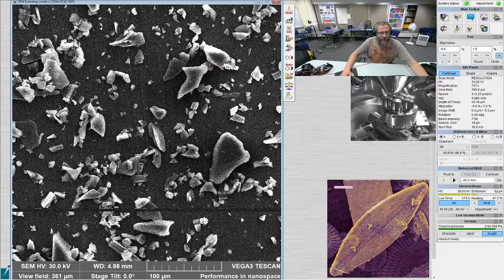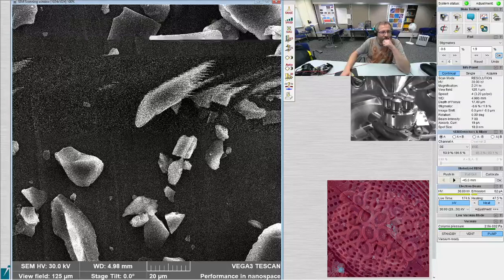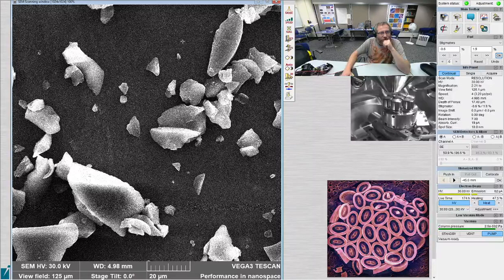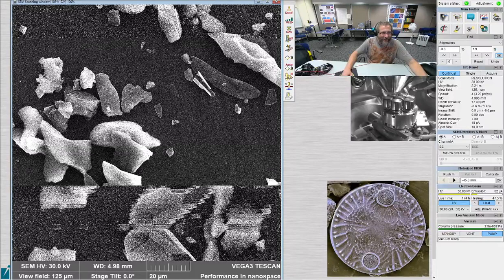I think you'd have to be zoomed in pretty close. I might have to scan through the sample right here at like a 20 micron scale bar or something where you could actually see, because I think it was only like 20 micron scale bar width. This is a real tedious slog to go through the whole slide at this scale, though. Probably not best for Twitch. Although, when we find it, it will be amazing.